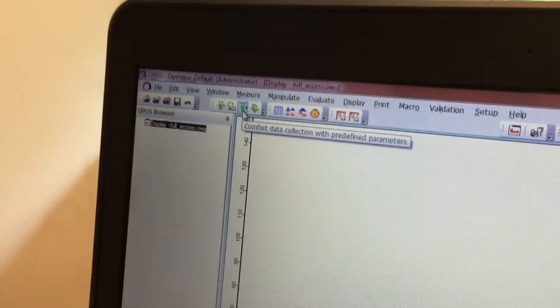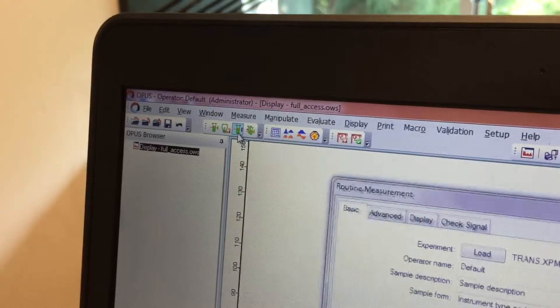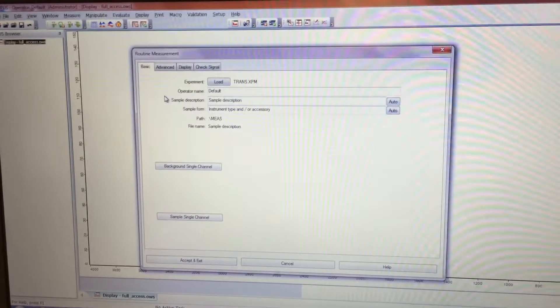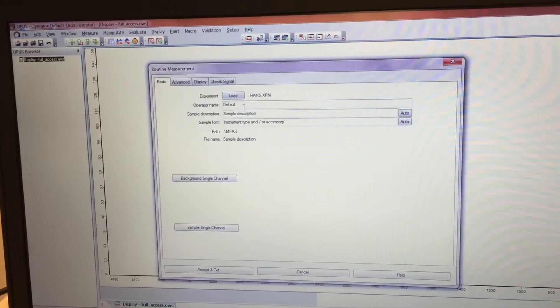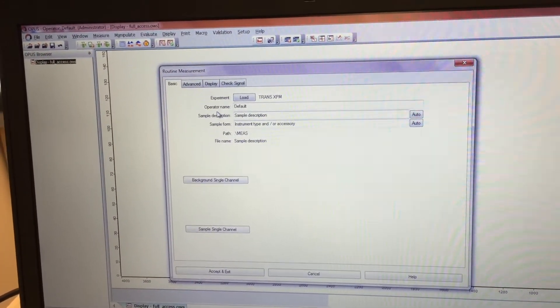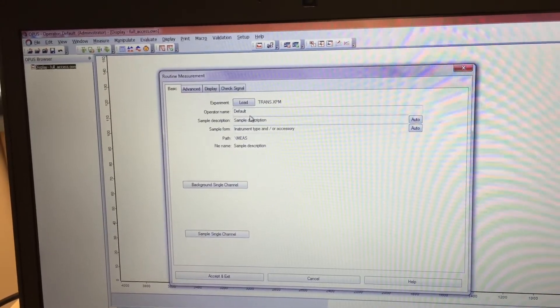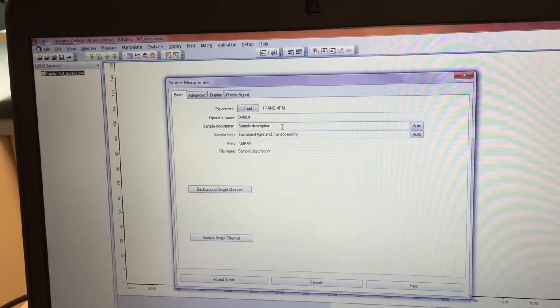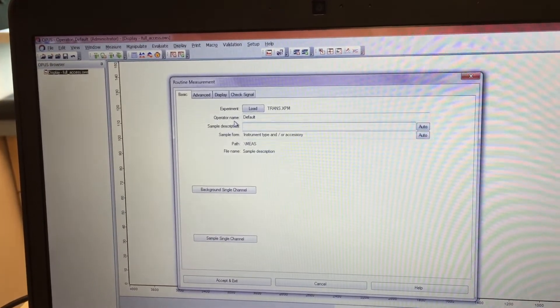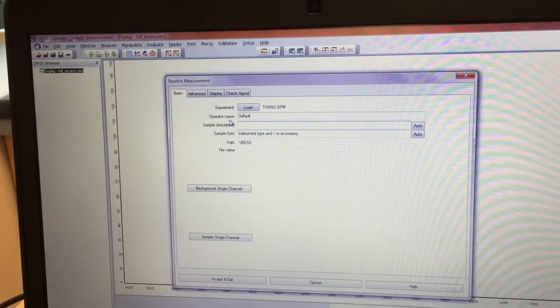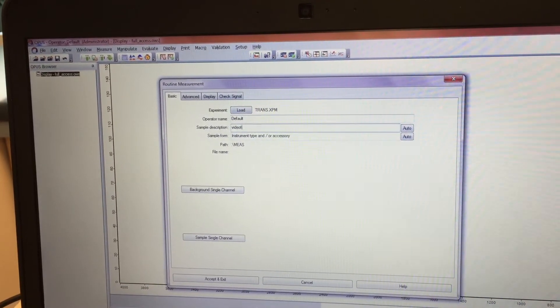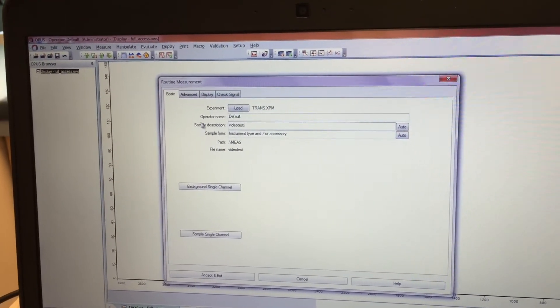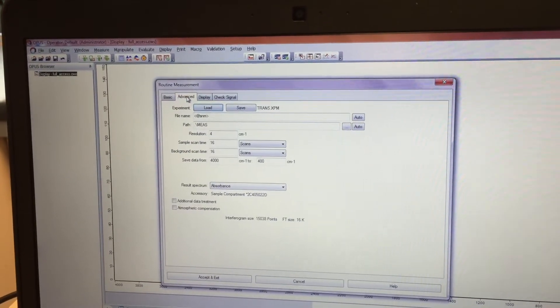Now we've added routine measurement, which is this button right here. You click on it and it gives you a dialog box where you can change things. There's basic, under basic there's the operator name which will always be default. Your sample description you can change. We will call this video test.